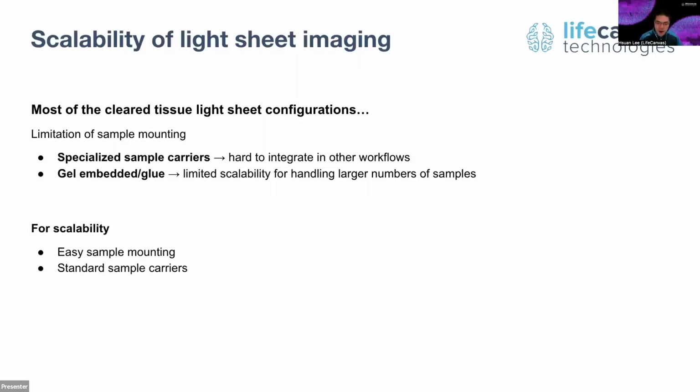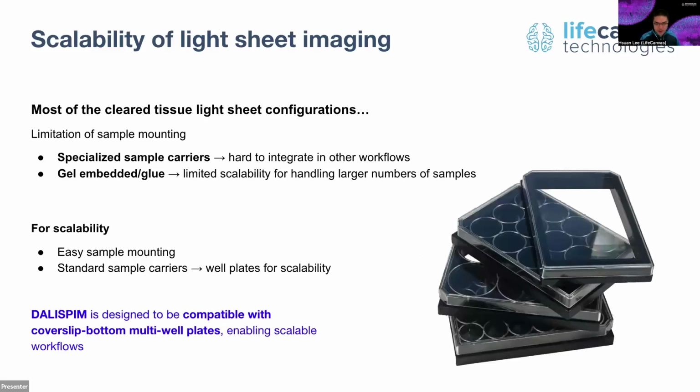To scale up the process, first of all, you need very easy sample mounting so that you can eventually mount even hundreds or thousands of samples. Second, you want a very standard sample carrier, so you don't need to pop the sample off the light sheet and put it on another carrier for another optical microscope. If you Google the standard sample carrier designed for scaled-up imaging, most of the time you will get multi-well plates. So the DALISPIM that we're designing is compatible with cover slip bottom multi-well plates to enable scalable workflows.